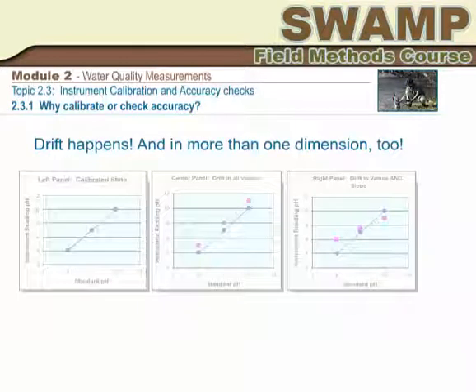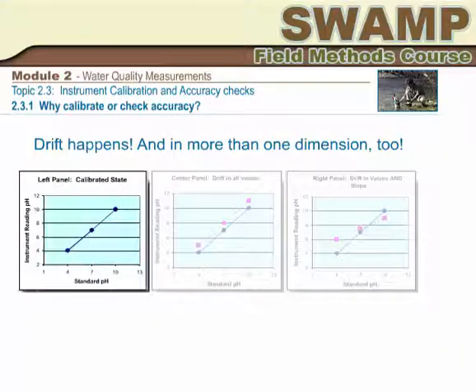Instruments and sensors used for scientific measurements are often based on sensing differences between 2 compartments through conductance of electric currents. In the pH and dissolved oxygen electrodes, one compartment is full of a concentrated electrolyte solution, which interacts with the external medium, such as your creek water, across a partition. An example of this would be the semi-permeable membrane of the DO probe. The electrochemical equilibrium, or balance across that partition, has to be reestablished every time the current is turned on, and it changes over time.